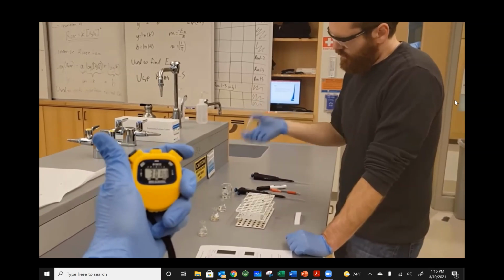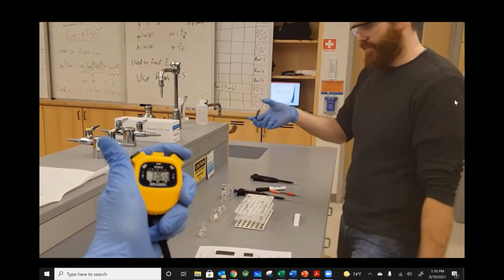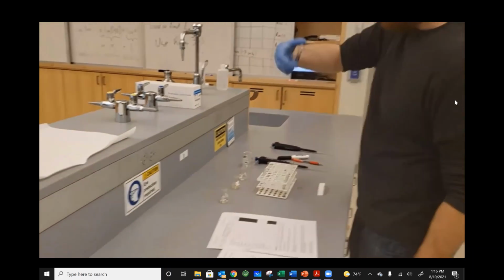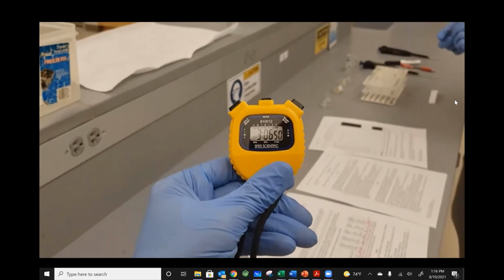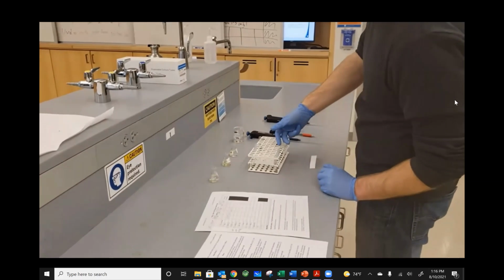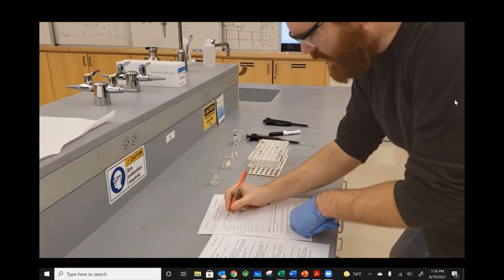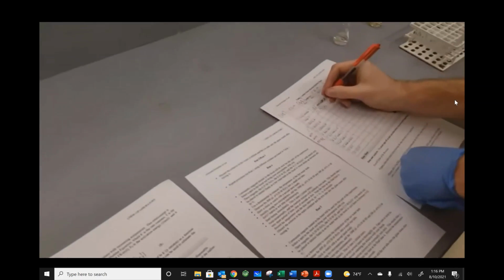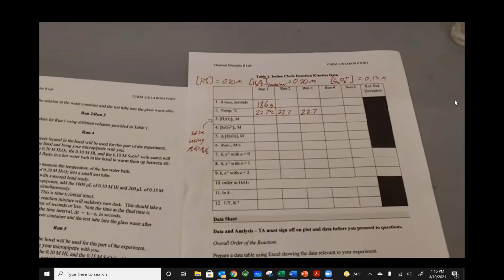Three-minute mark. And there we go. So how long was that? 3 minutes, 6 seconds. For 186 seconds. So run one at a time of 186 seconds. Get a new glove. Now that that is done, we can move on to run two.